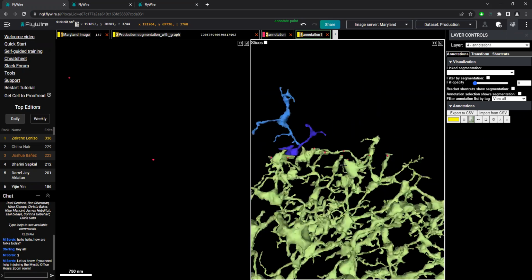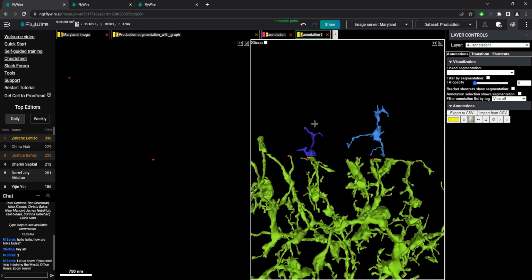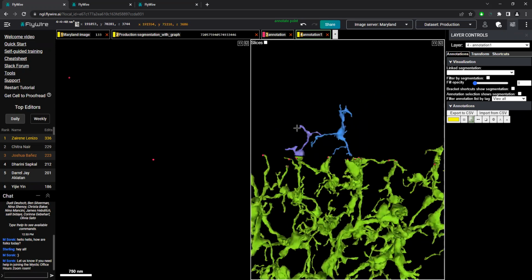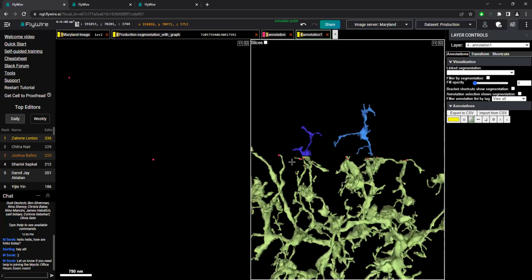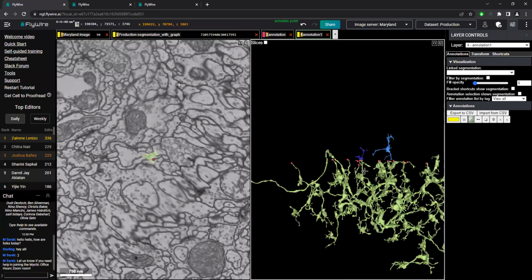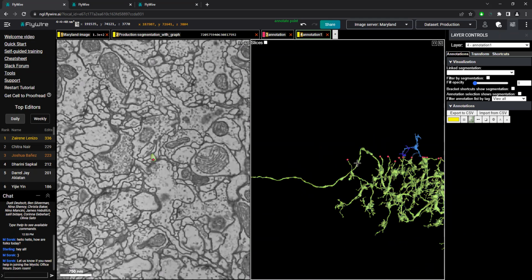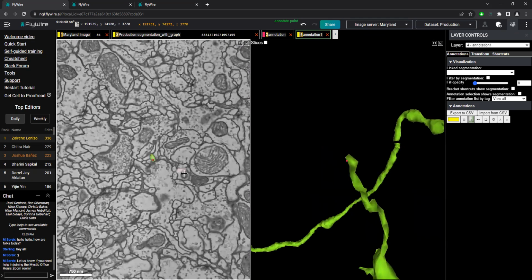And as you can see, what I'm adding on here where these cut off, these are actually not just a little twig part. It's actually the rest of the synapse point here, and we're adding in more branch structure. So it is important to go in and check all these and add them in rather than skipping over them. Now, if we looked at this one maybe way out here, I think it just ends.